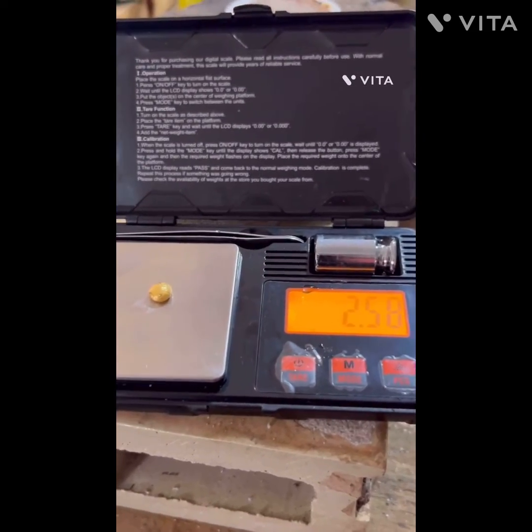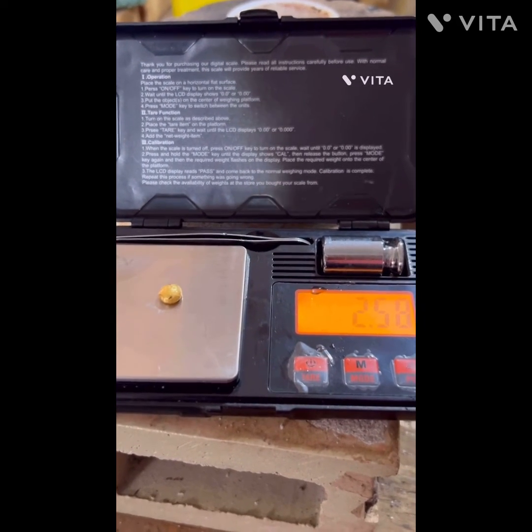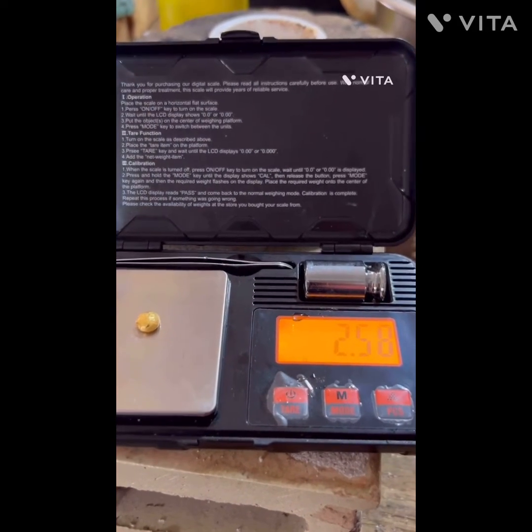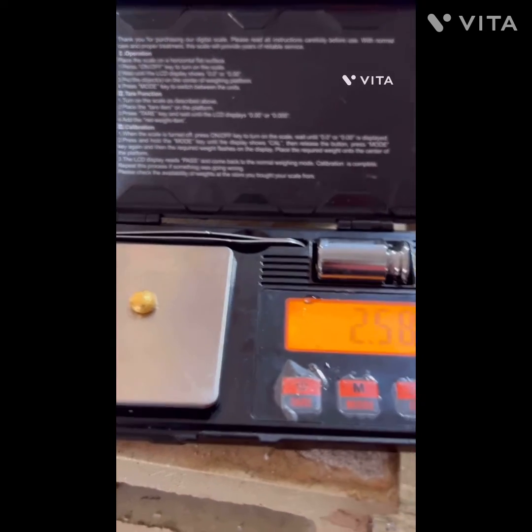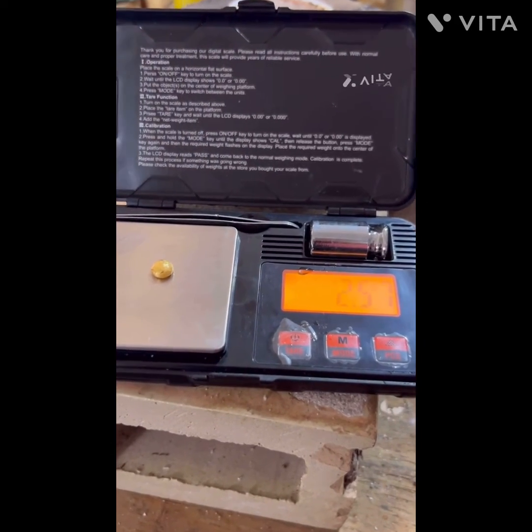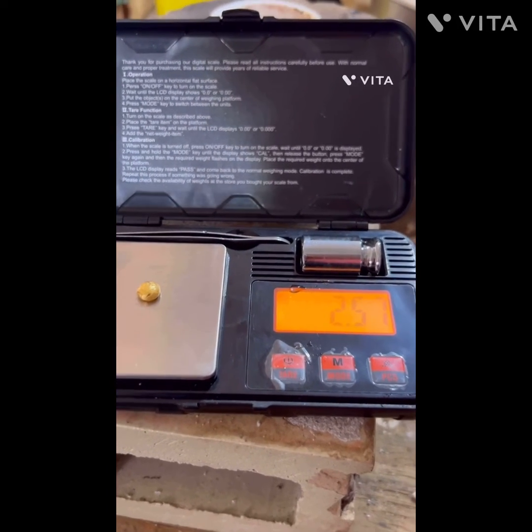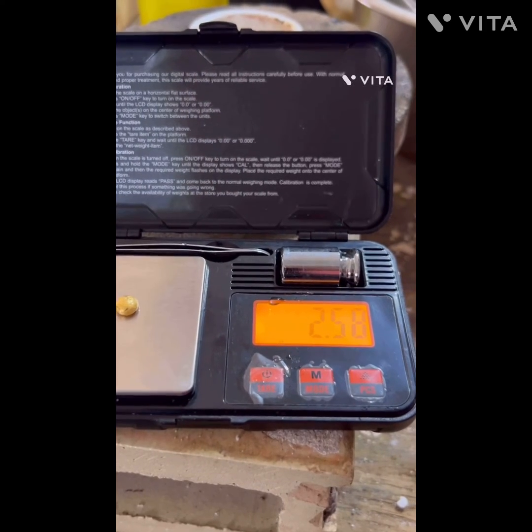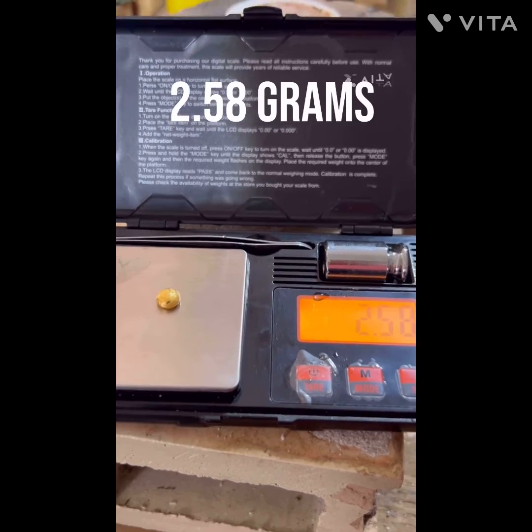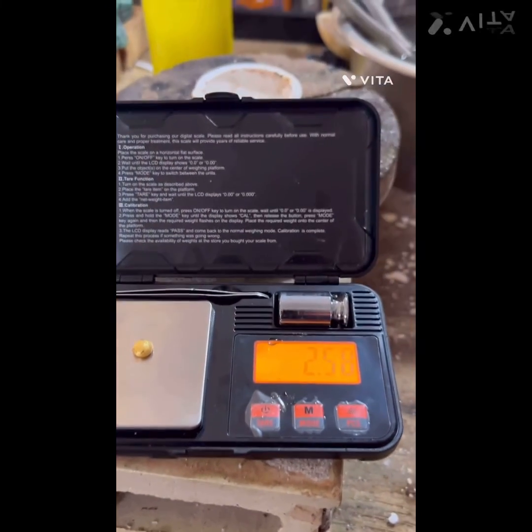Man, I cannot tell you how excited I am - two and a half grams. There was a poof - lessons learned. But that's not bad at all. I was expecting like half a gram. That is really not bad. It needs a little bit of cleaning up. I had some issues - I dropped it in a shot and didn't like the way it looked, so I did a little button, and I need to clean it up. But that's enough to keep it together - 2.58 grams.